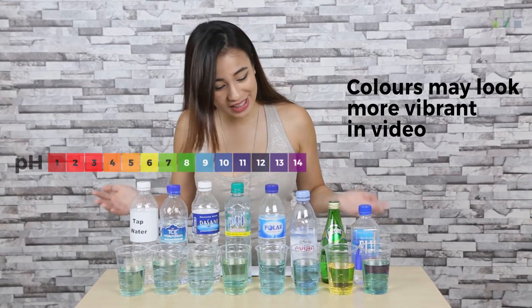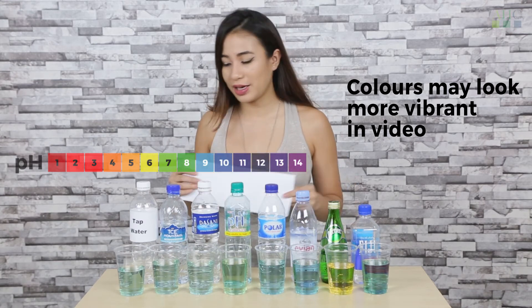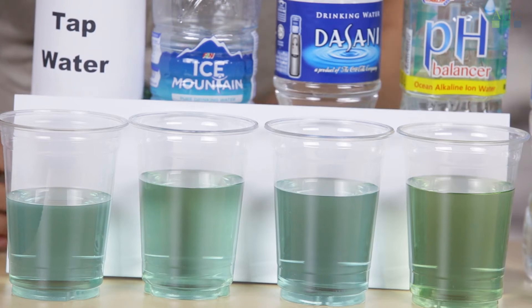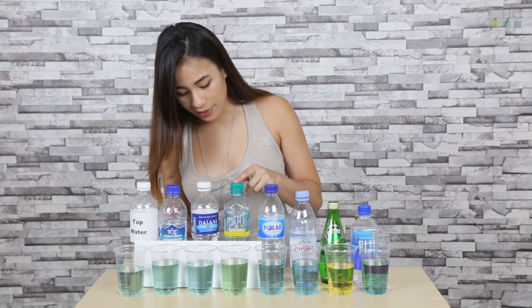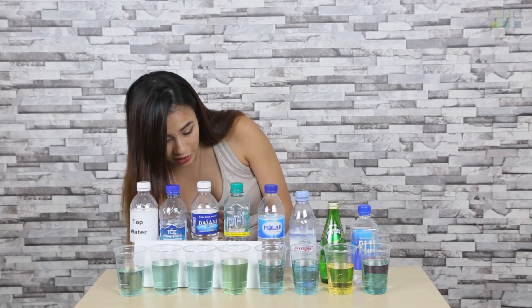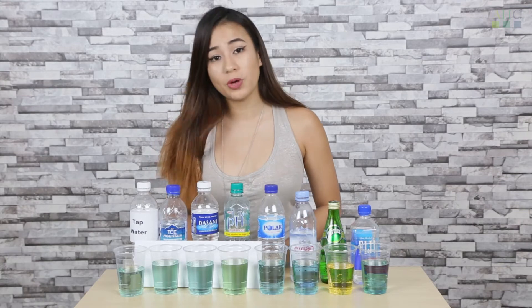So here are the results. As you can see, they turned out pretty neutral. I'm going to put this piece of paper behind the cup so you can see the colours better. The first three came out a light green, so it's on its way to neutral. This one turned out more green, but on the bottle it states that the pH level is 8 to 9.5, which means that it should actually turn out blue to purple.